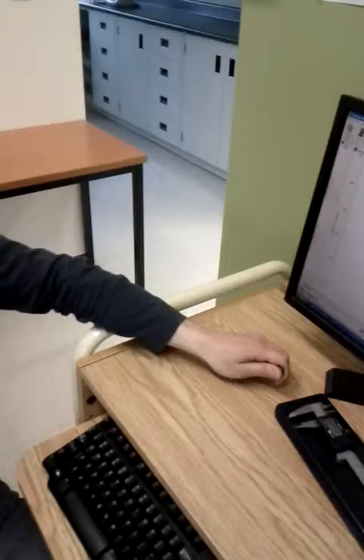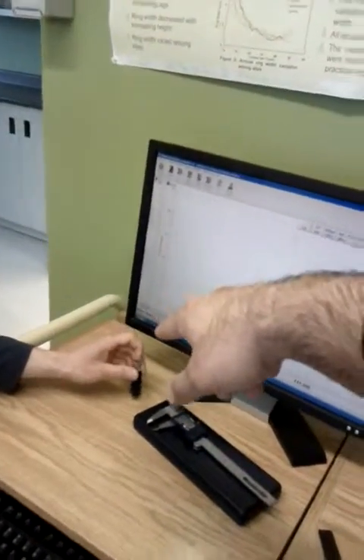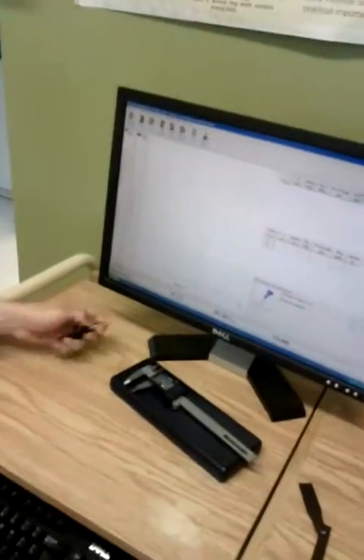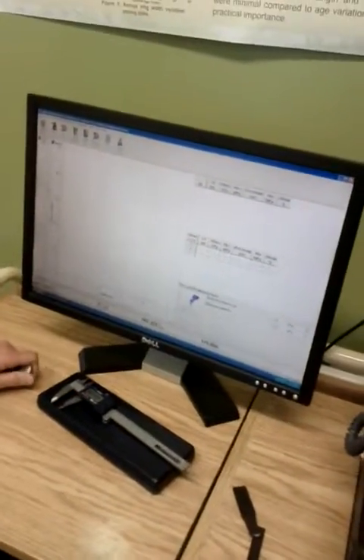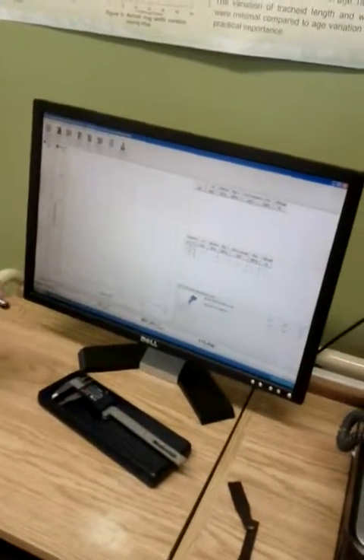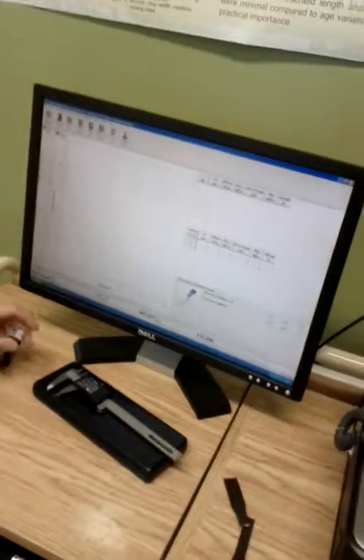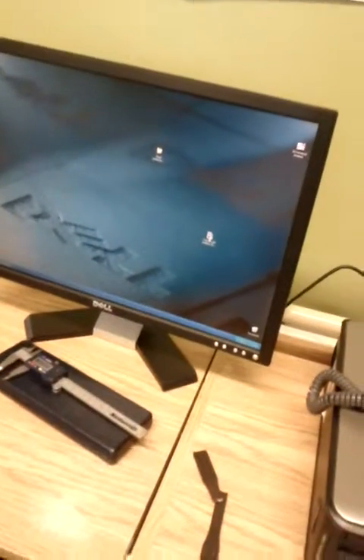So if we want to do a test, do we have any sample? And also we need to get that file from you? Yeah, because it's already all prepared and tested. You know, there's always something wrong. We worked on this file many times before it was as we need. So I give you a flash memory just to transfer it. It's right here on the desktop.